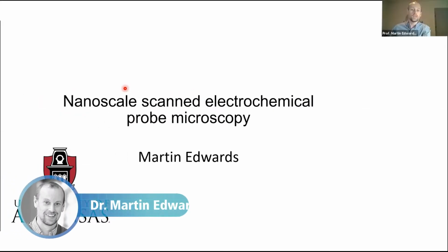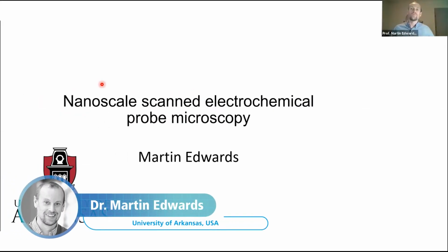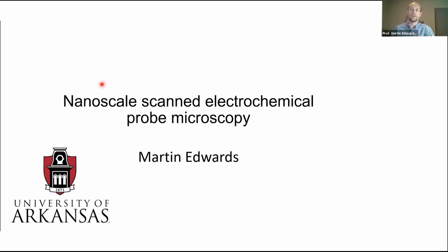Morning, I'm going to talk to you about a non-AFM type of scan probe microscopy, and it's electrochemical microscopy. I'm going to really introduce the instrument to you more than digging down into the applications, but I'm going to give a few examples at the end of this presentation.